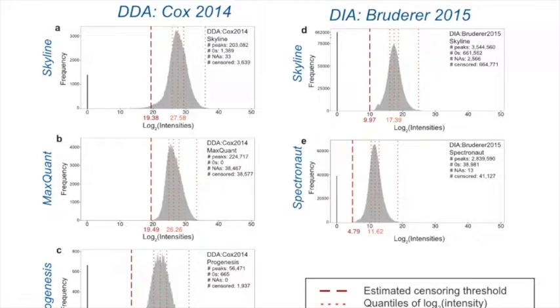But still, it's interesting to see that there is so much difference between data processing tools. And of course, here as well, you can see quite a bit of shift, and also the difference. So here you have 2,500 NAs, here you have 13 NAs, and more zeros here than here. Again, it's not a judgment call. We're not saying which software is doing better or others. We just point out that we may have to handle different inputs differently.